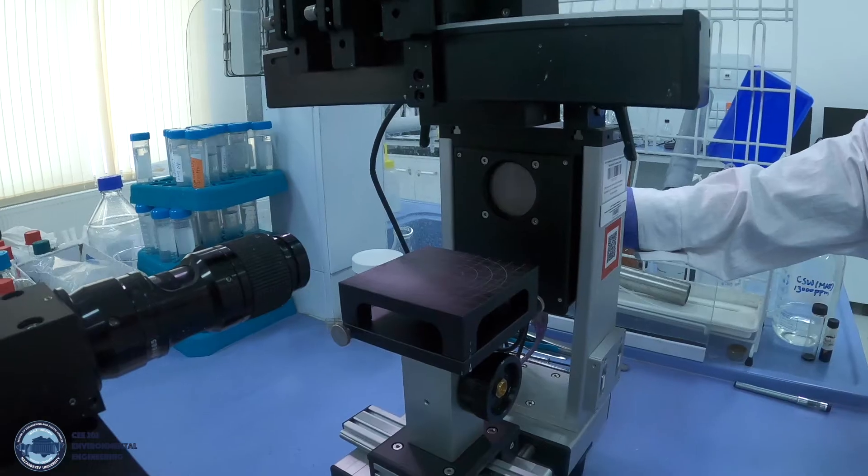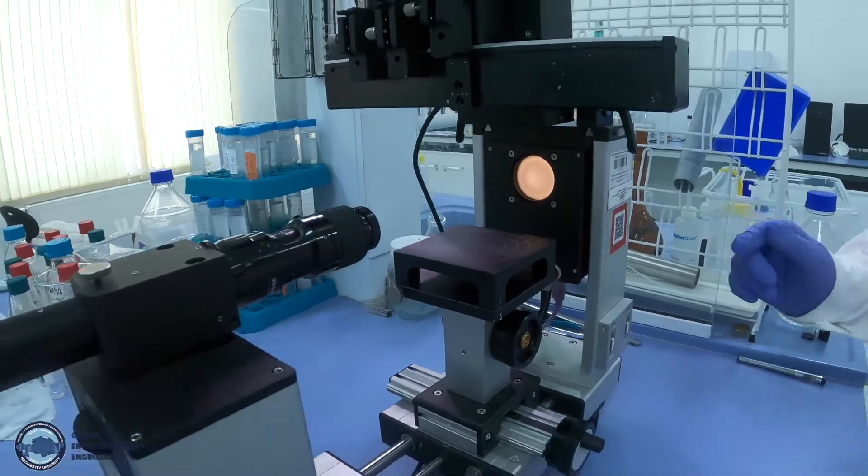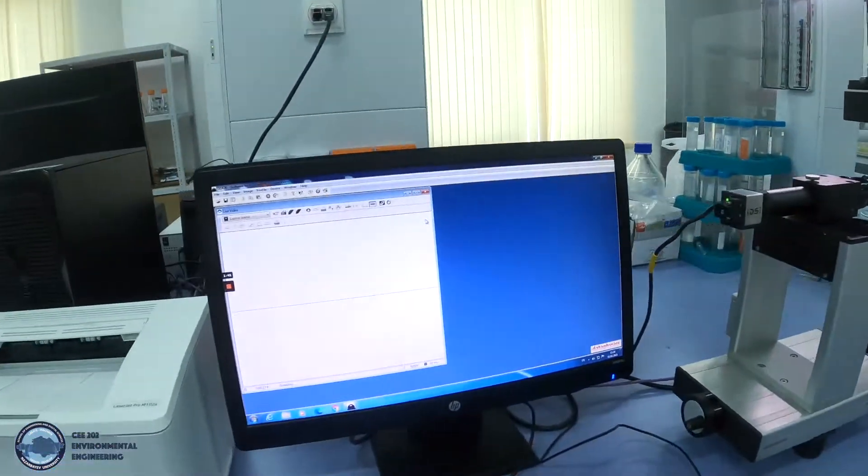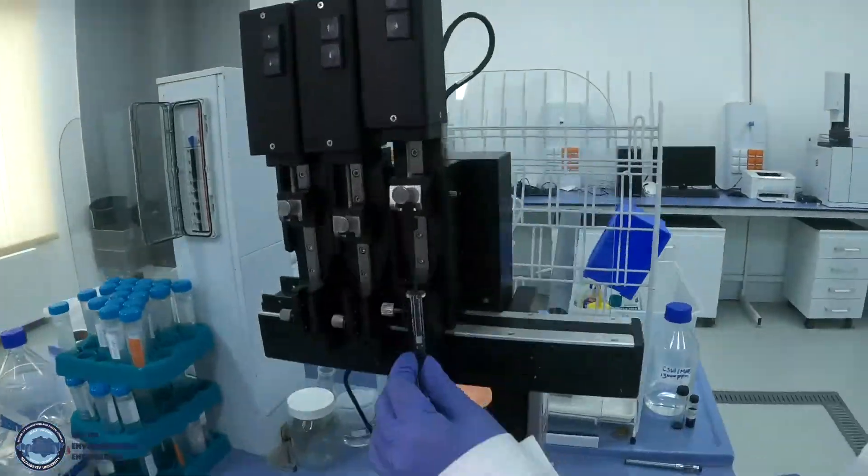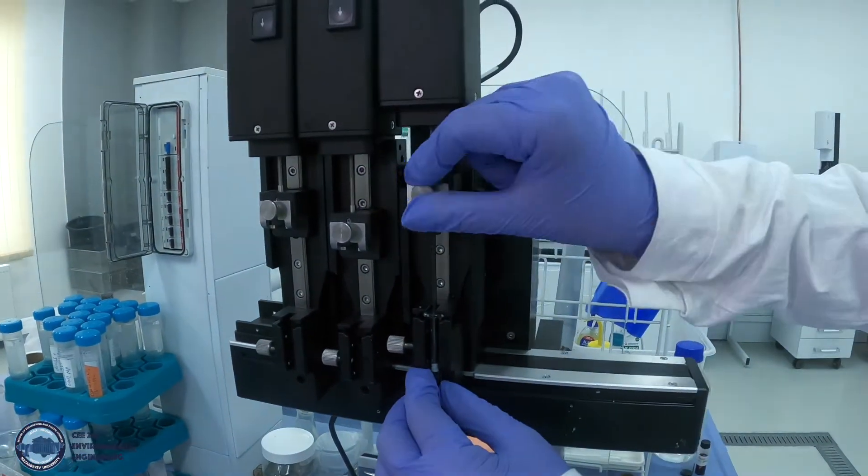Next, we will turn on the light on the device and take out the cap of the objective. Then we will install dosing syringe to the equipment.